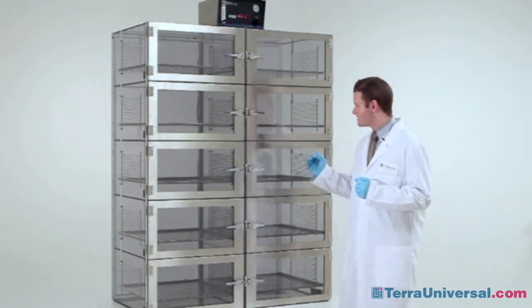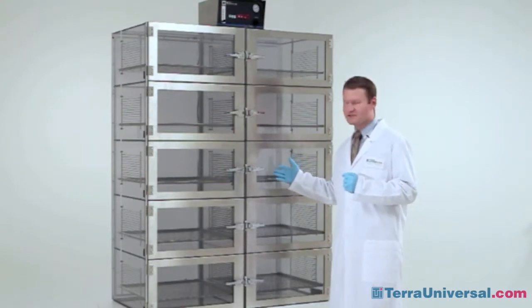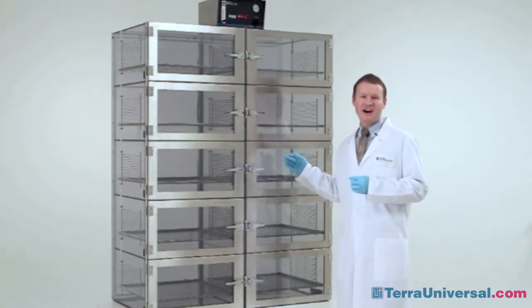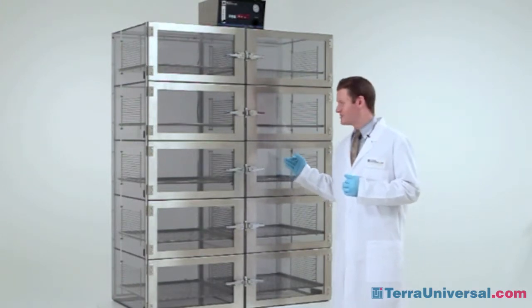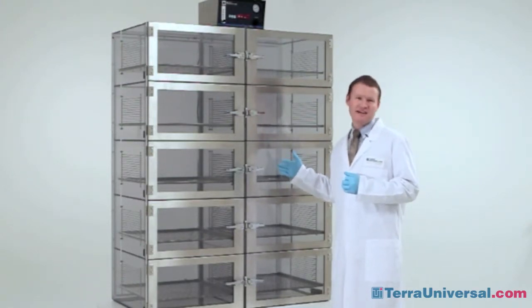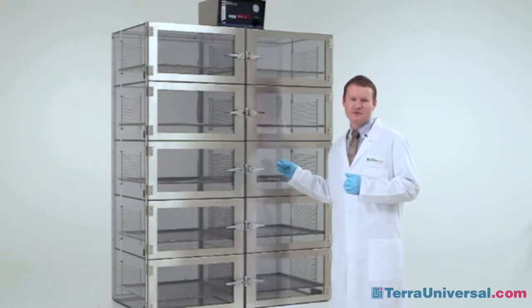This dry box is composed of static dissipative PVC. As the name suggests, it does not allow for the aggregation of static surface charges, making it perfect for the storage of static sensitive samples.